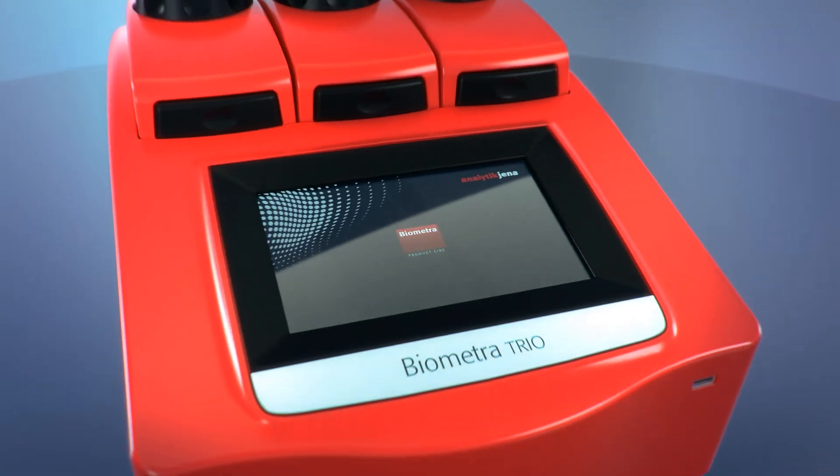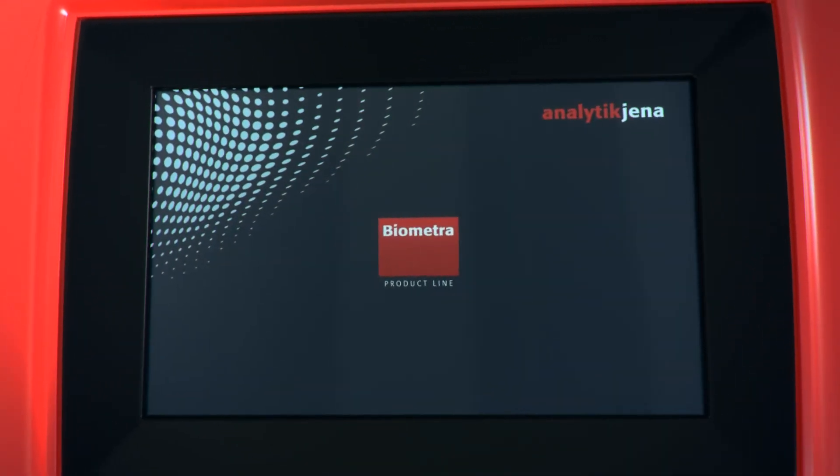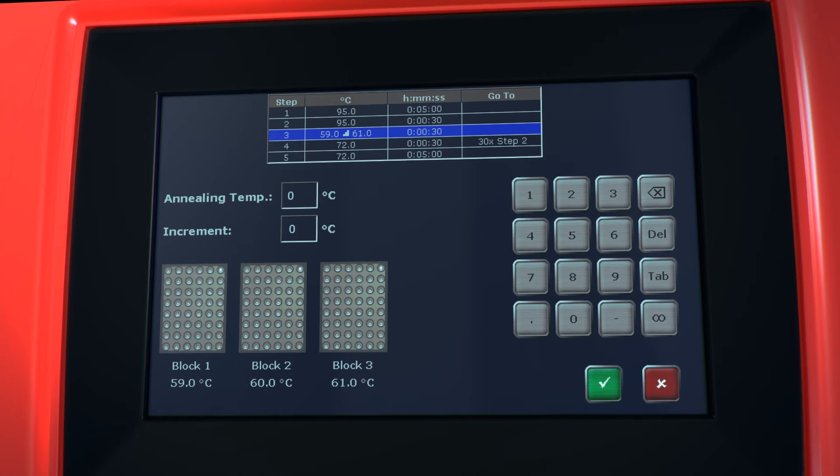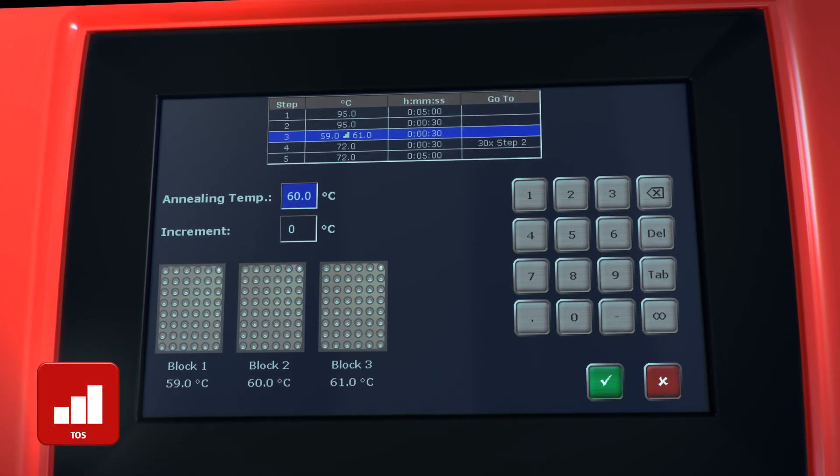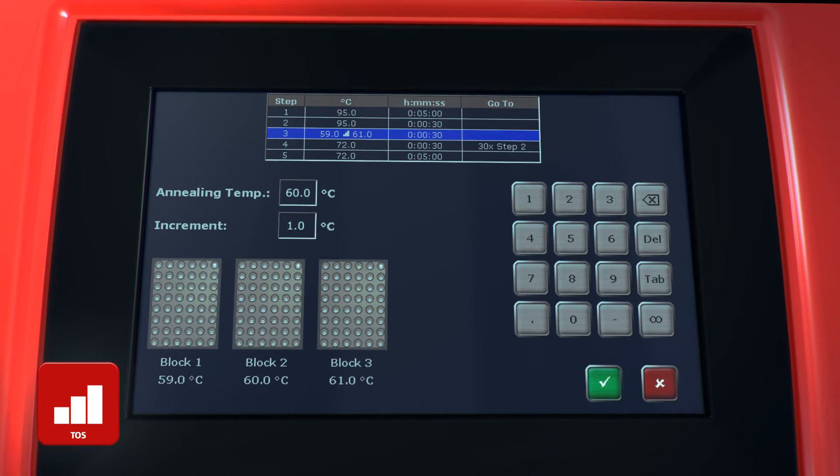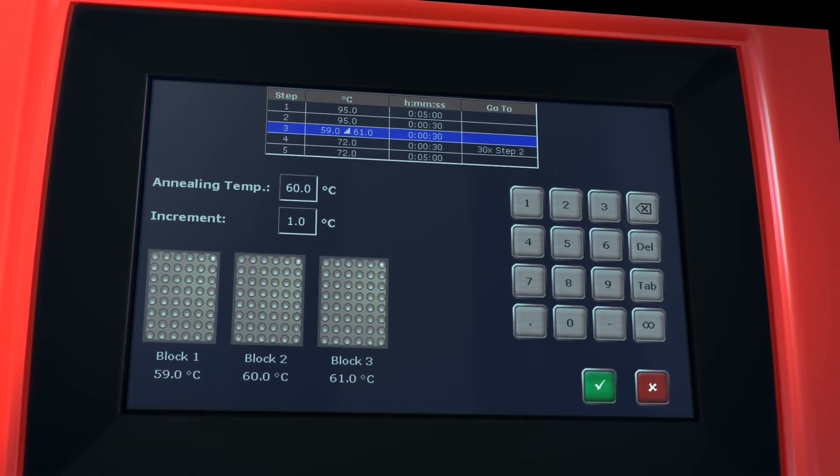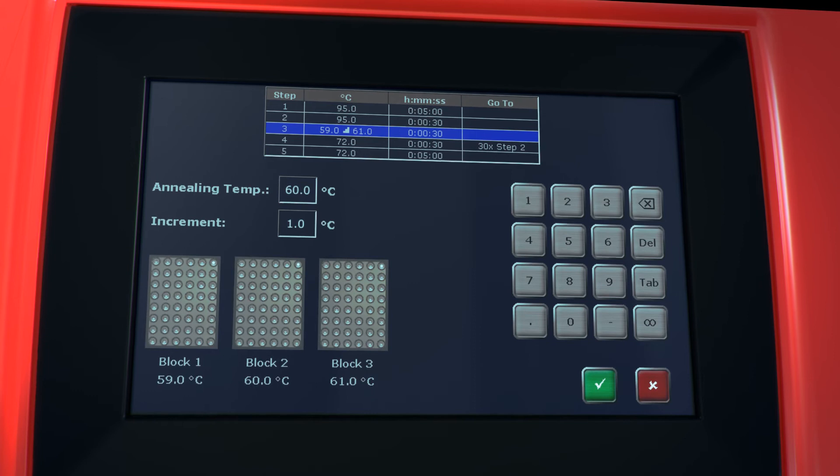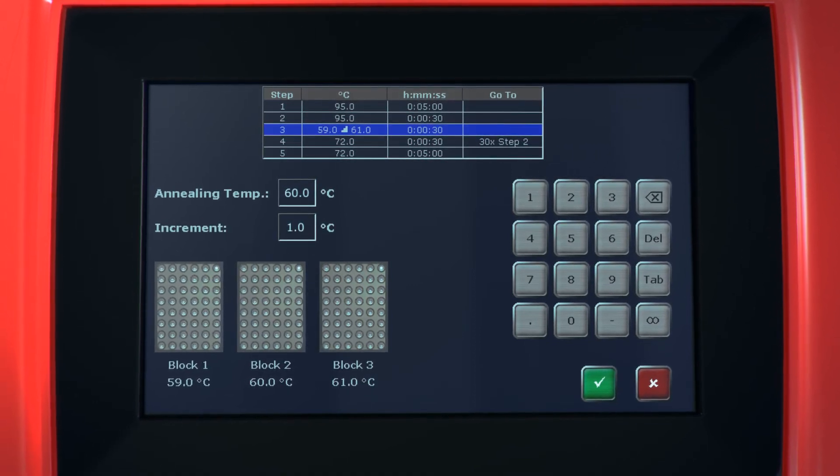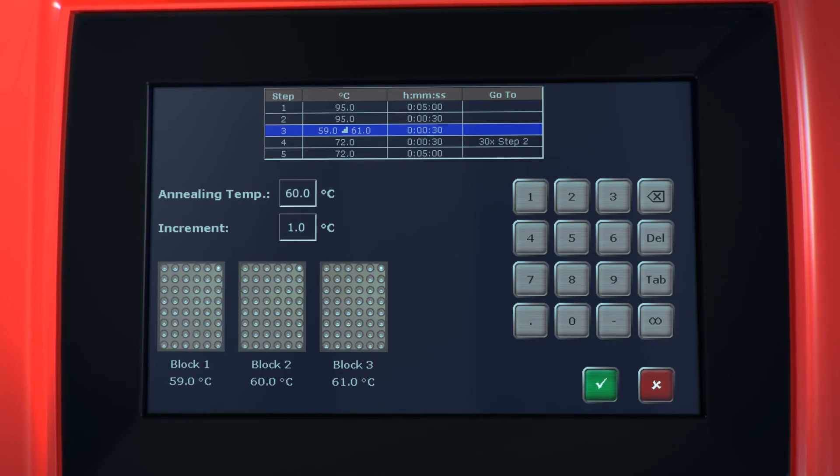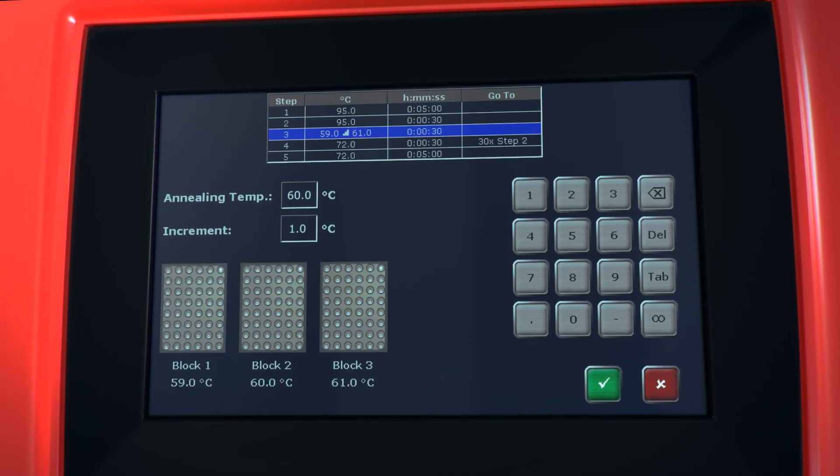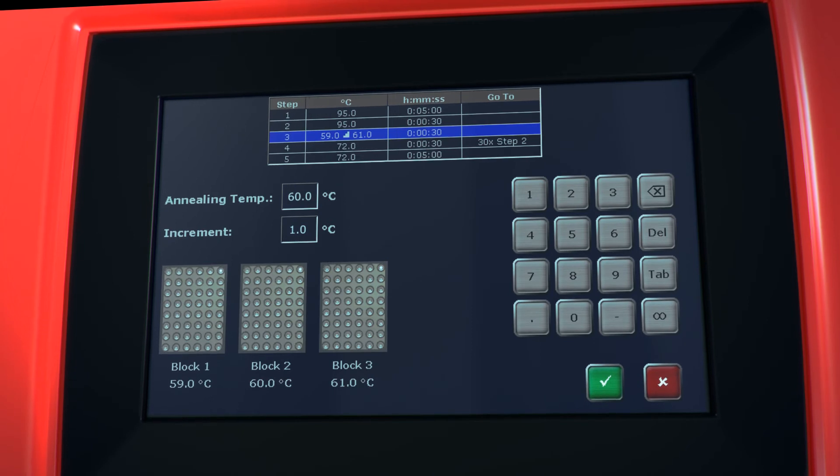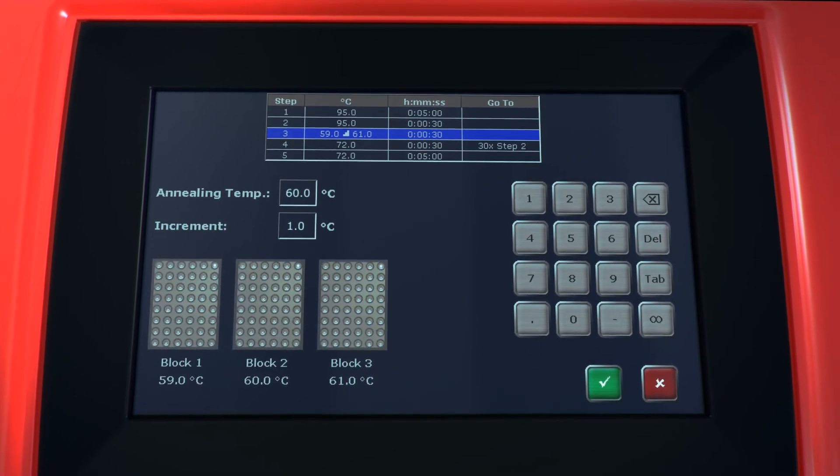Task technology for annealing temperature optimization. By using the Biometra Trio temperature optimization step tool, new primer pairs with unknown annealing temperatures can be tested quickly and optimized in very short time. The temperature optimization step tool makes use of the three sample blocks and provides three different temperatures for a selected program step. Only the primer annealing temperature and the temperature increment have to be filled in to program a gradient-like TOS step.